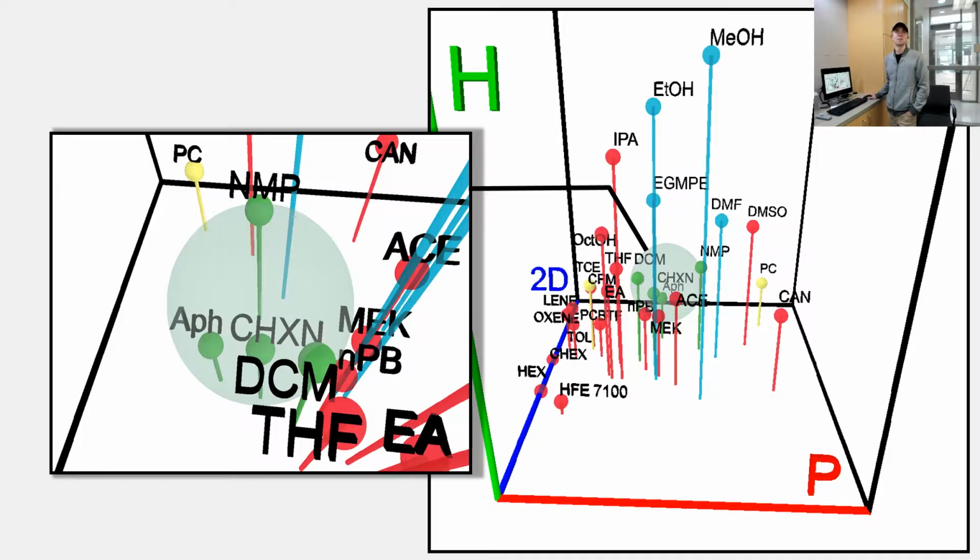You can see there are bad solvents in between the two spheres. They're not exactly in between, but if you try to fit all of those in, the sphere will be too big and get the ones on the side, like IPA, octanol, DMSO. And there are two solvents, propylene carbonate and chloroform, that didn't fit into either sphere.